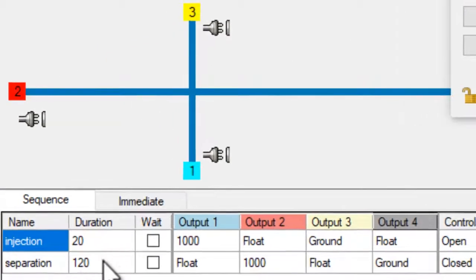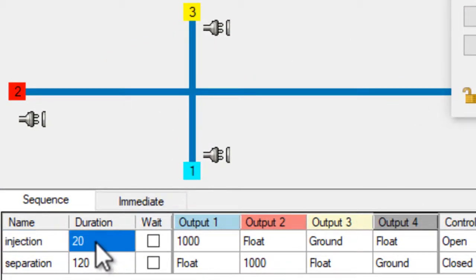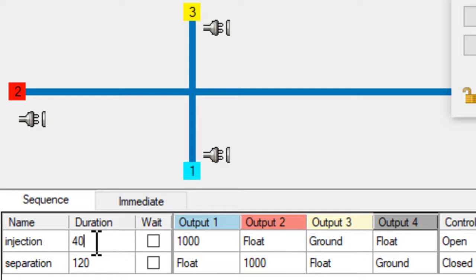Here is our sequence. I'm going to change the duration of the injection step to 40 seconds just to give me time to explain things to you.